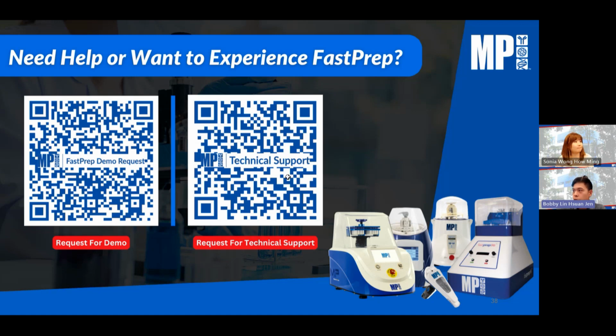Zara has a question. She's saying that I'm working with fungi and was wondering if the aggressiveness of our fast prep could impact the enzyme extraction efficiency or might possibly degrade the enzymes.